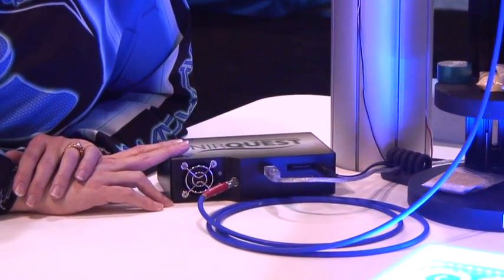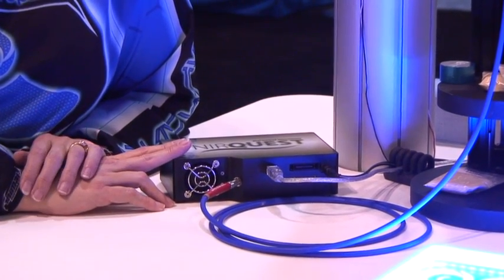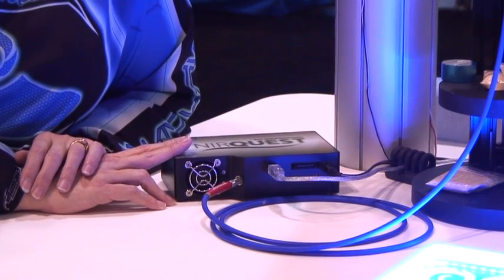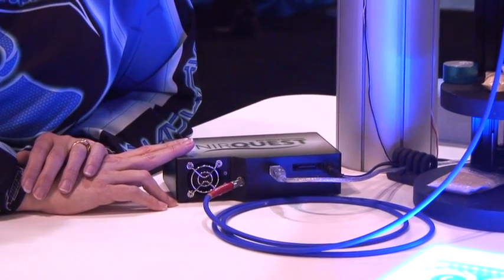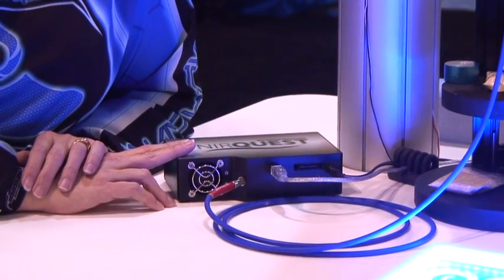This spectrometer has a new detector in it, which gives us great sensitivity over a range that we didn't currently have available in our product line. This spectrometer has sensitivity from the 1,100 to 1,900 nanometer region, and it is great for customers who are trying to look at hydrocarbons.